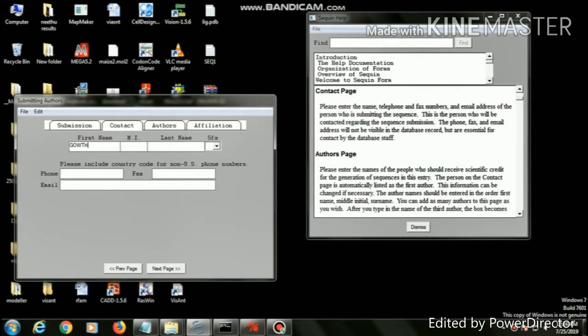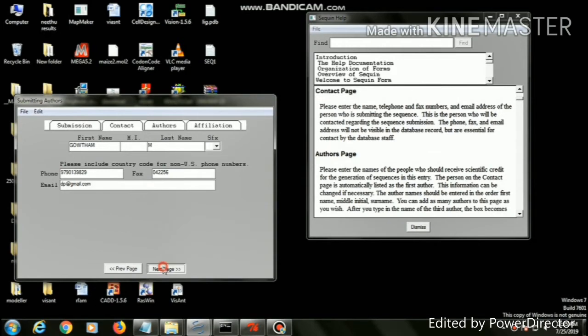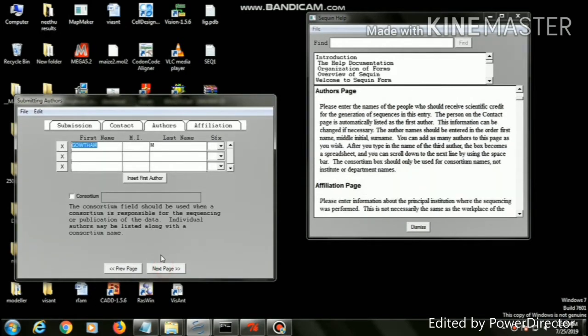It will ask for your contact information like first name, last name, mobile number, fax, and your email ID. Fill in the information, then click next page. The contact information will not be visible in the database but it is essential for contact by the database staff.